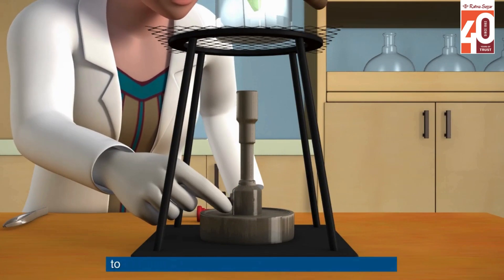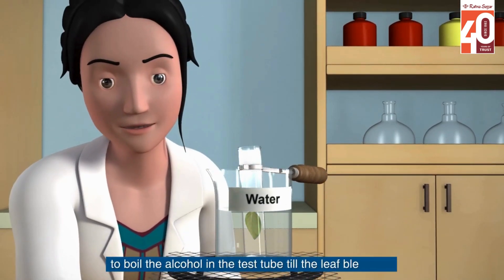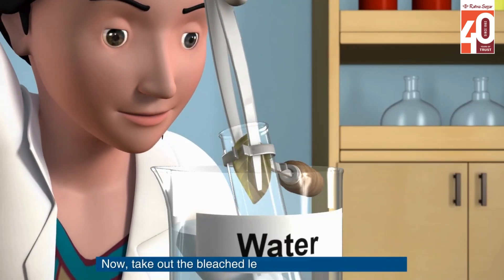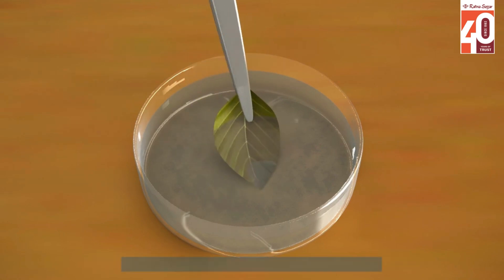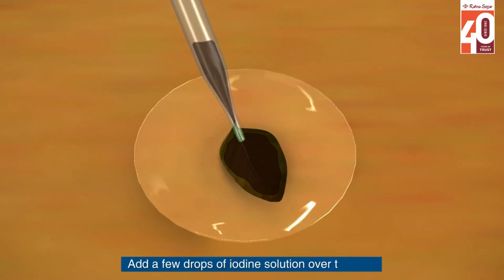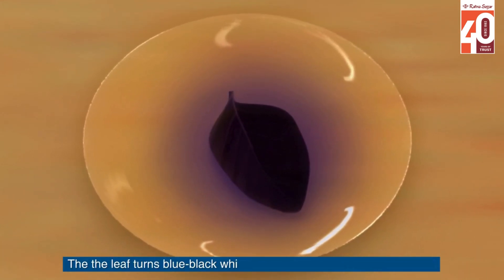Boil the alcohol in the test tube till the leaf bleaches. Now take out the bleached leaf and wash it in cold water. Add a few drops of iodine solution over the leaf. The leaf turns blue-black, which shows that a green leaf has starch.